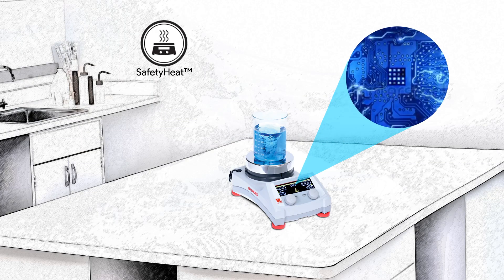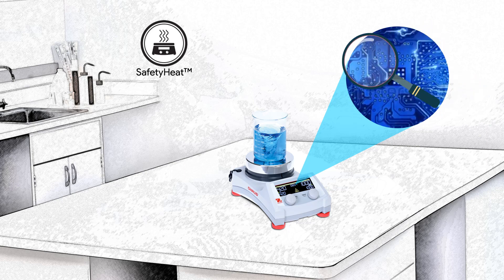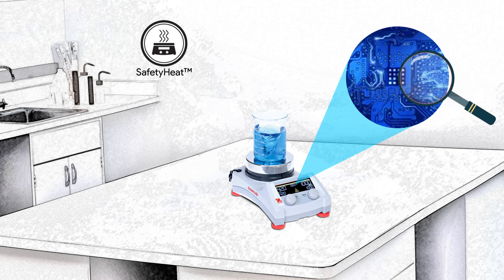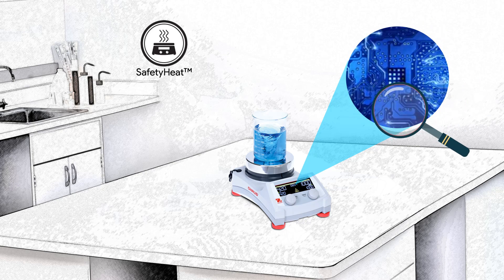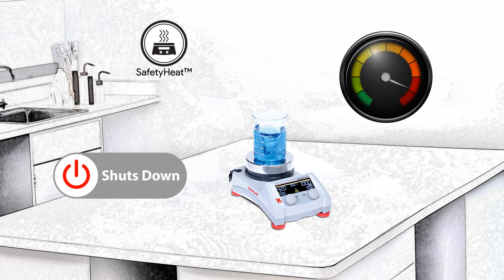All sizes in the Guardian Series feature Safety Heat, our industry-leading internal protection system that assures safety in heating applications with dual monitoring of system health. Safety Heat will shut down the heating function if the unit detects a potential problem before an overheating condition occurs, in order to protect the sample, lab tech, and the lab.